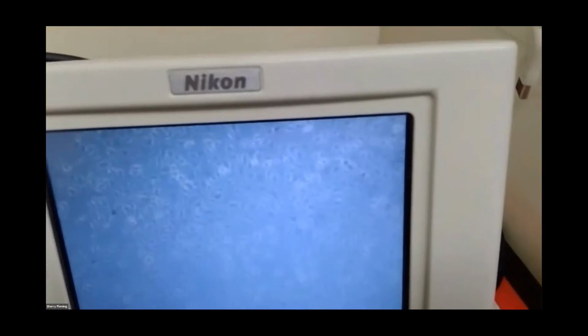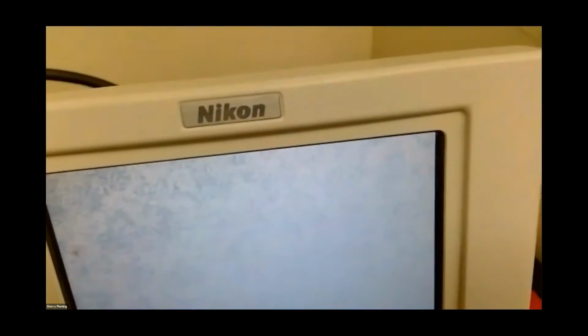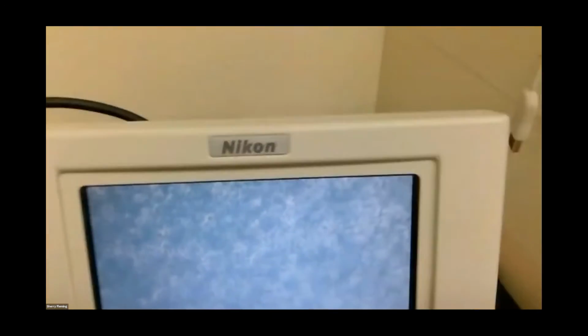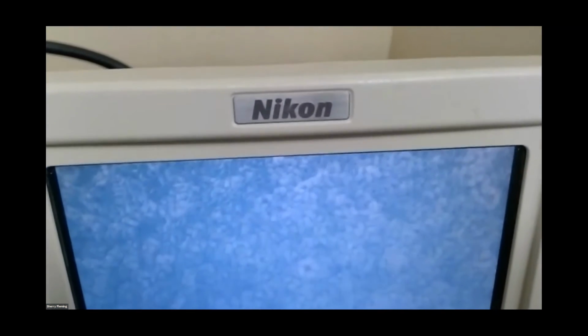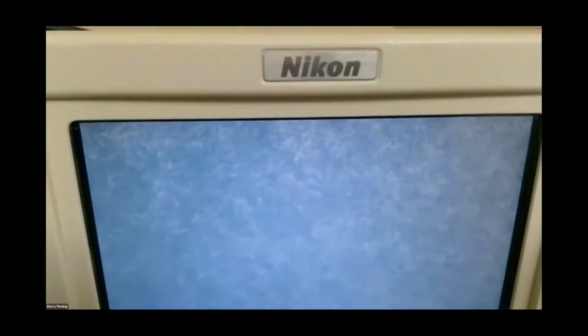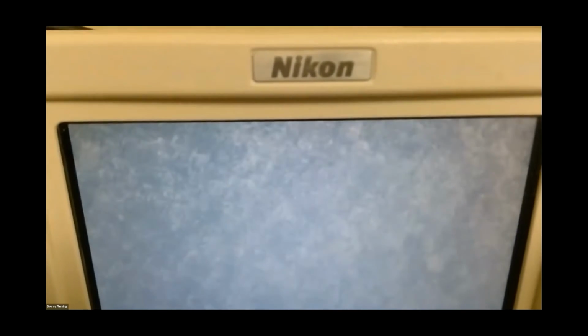But if we look at the cells that have turned very dark, these are melanoma cells, and so the melanocytes are the cells that allow your skin to have skin color, but they also can overgrow, and you can maybe see here at the top that we have some that are turning dark black. These came from a black-skinned mouse, and eventually these cells will turn very, very black. Of course, I can't find them right at the moment. They were there earlier. Depends on where in the plate you are.